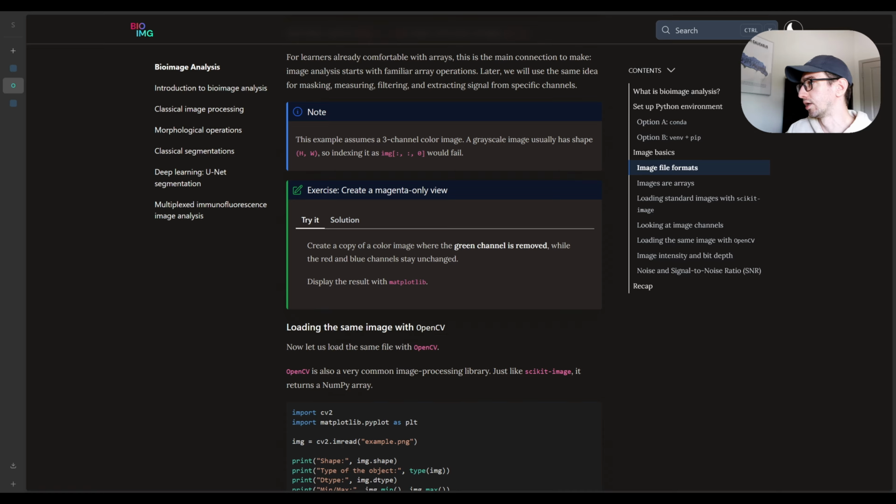Because we will see cases where, by doing some steps, we lose important information. And with generative AI it is sometimes tricky. There are definitely some neural network based techniques that people use, and we will see them indeed. But we should always be cautious about that.